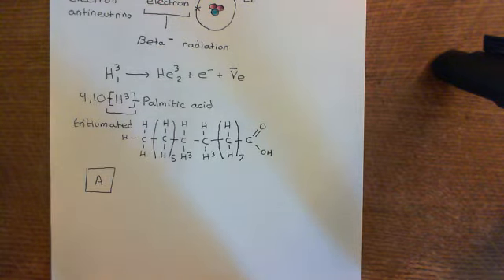Okay, right, so the first thing to say is that you are going to start with a cell line of some sort, and you are going to transfect in an extra gene for protein A, and the reason you're going to do this is that you want a huge overexpression of your protein so that the experimental results are very clear, basically. So you've got a large amount of the protein to be working with.